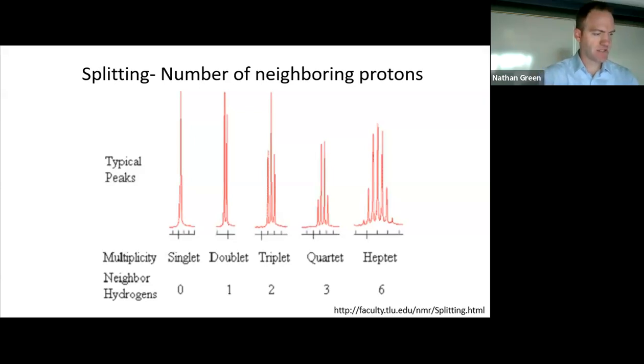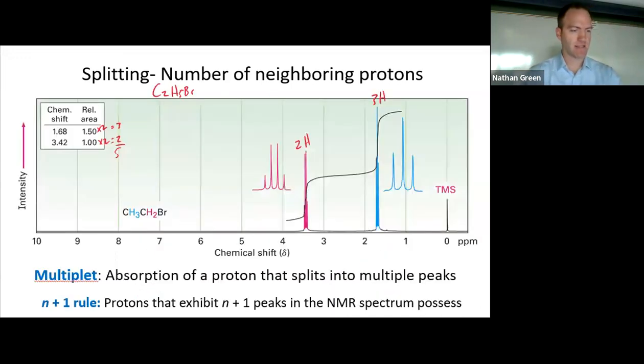And everybody can tell that this is 1 peak, and that's 2 peaks. And this is 3 peaks, short, tall, short. This is 4 peaks, short, tall, tall, short. Again, I know this graphic looks bad. It's also kind of fuzzy. I intentionally found something like this because this looks more like real world data. That is more real than something you're going to see that looks like this. This is artificial. It's cleaned up for you to look this way.